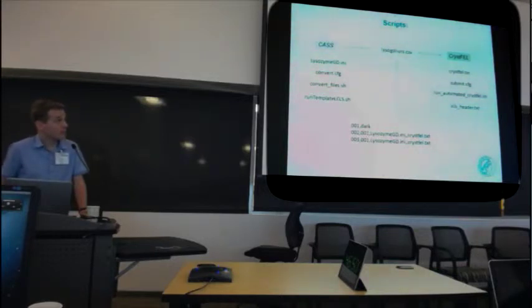Those two parts of the analysis and scripts are connected by one CSV file, which has all of the run numbers and associated dark files. It looks like this.